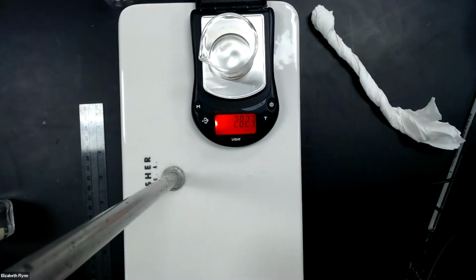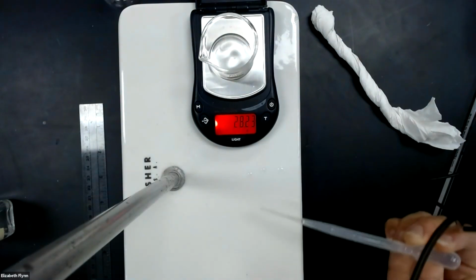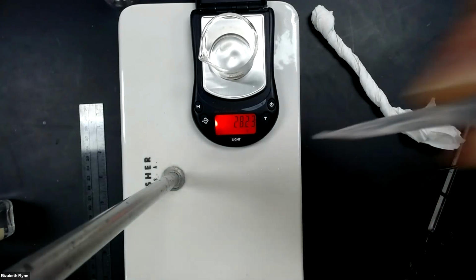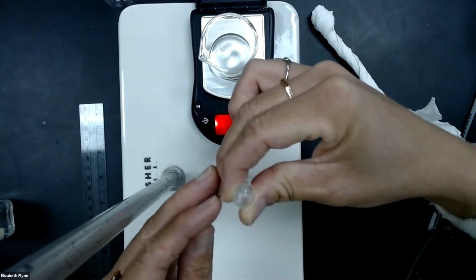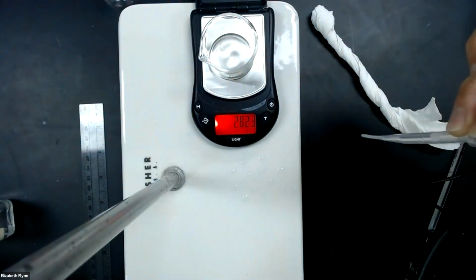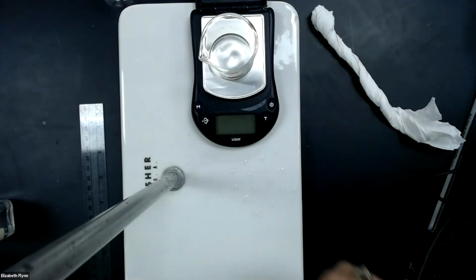So when I'm making the drops of the same size, I want to make sure that I am dropping vertically. This is the standard delivery technique. Okay, I'm not dropping horizontally like this because that leads to inconsistent drop sizes. I'm dropping vertically. And I want to make sure that the drop does not touch the surface before it completely comes out. So you're practicing making drops of the same size. And these are looking pretty good. Okay, so just practicing.